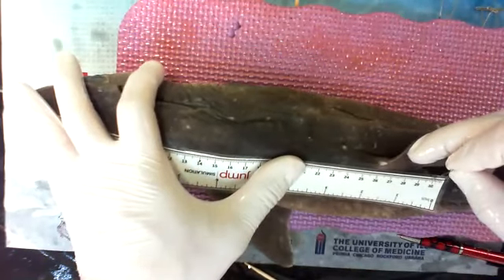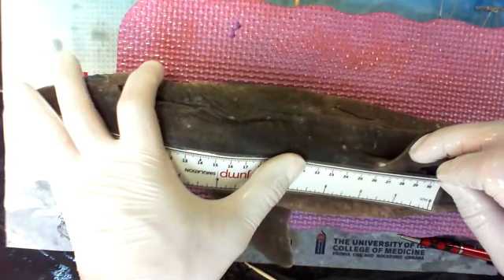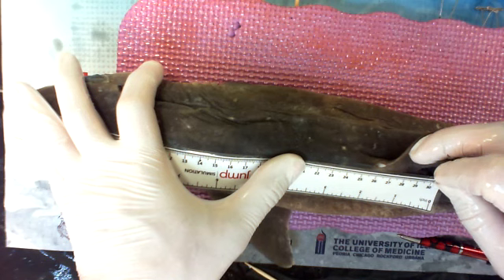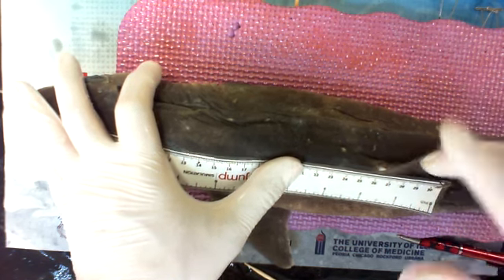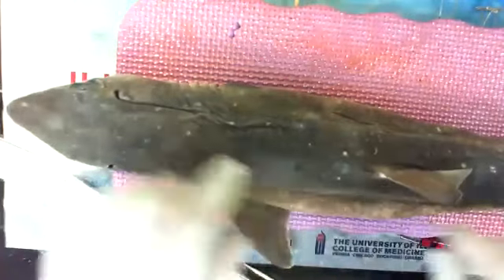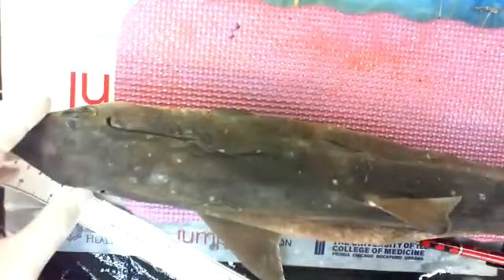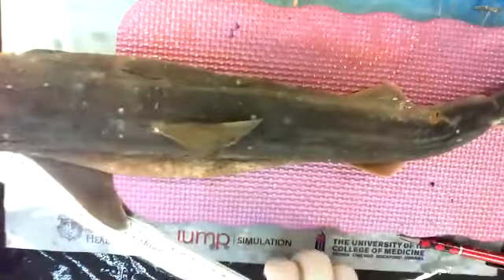And I'm going to take a pin and put the pin right at the 30 mark. When I poke it in, it's going to pop a little bit. Pop. Just put it into the pop. So we'll talk about the skin. The skin's really tough. You just have to break through it, and then you're into muscle. So there's the first pin right there. Now I'll just move my ruler down.